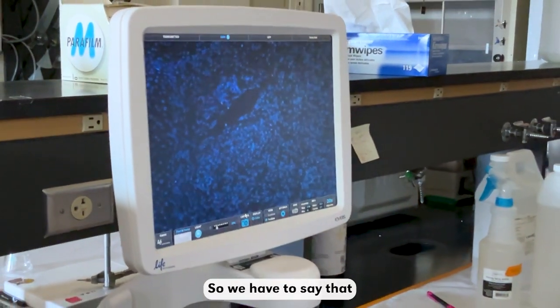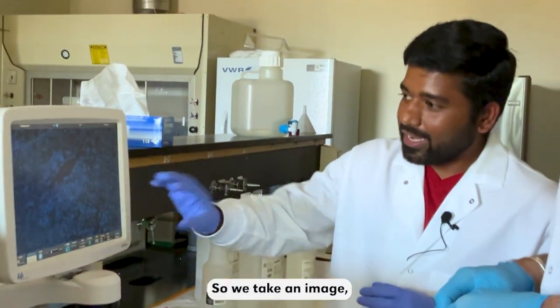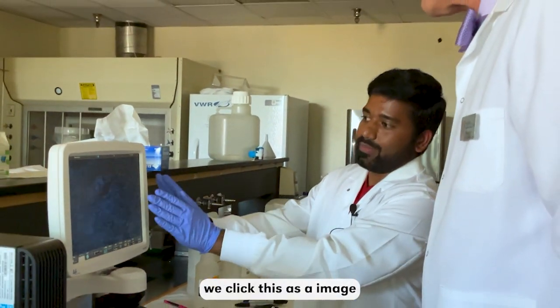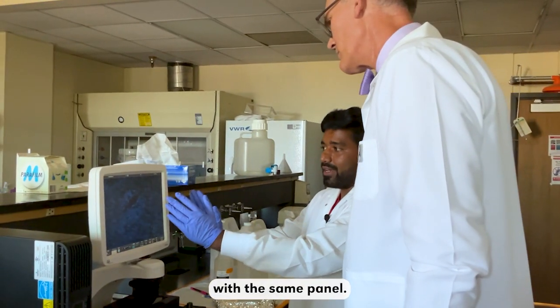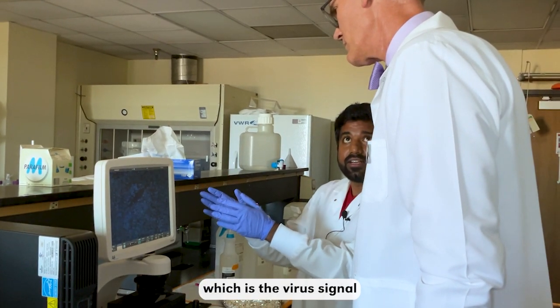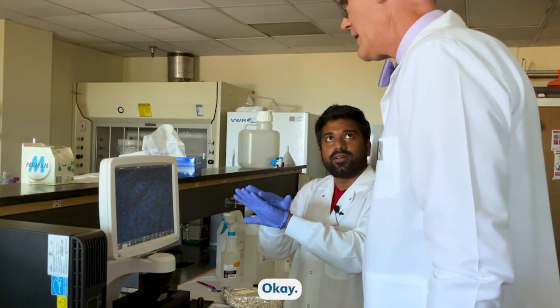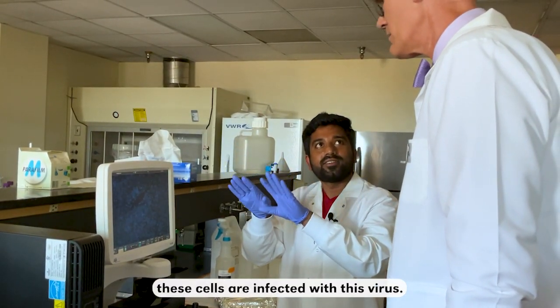The virus is the one which infects the cells, right? So we take an image, and with the same panel we go to the green signal, which is the virus signal, and we merge that. So that we can say that yes, these cells are infected with this virus.